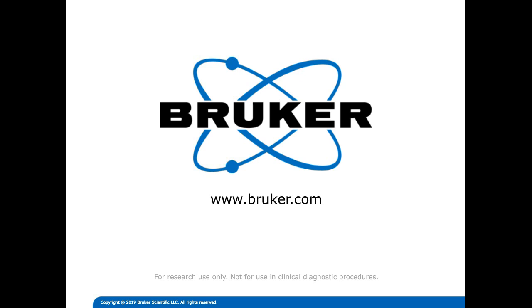Another question asks, how long does it take to prep a 96-spot MALDI plate? This would depend on how the prep is actually done. If one does a manual preparation, it takes about a couple of minutes per spot. If you use an automated spotting instrument, then this would probably take about a few minutes for each plate. Again, that depends on the actual instrument that's used for the automated spotting.